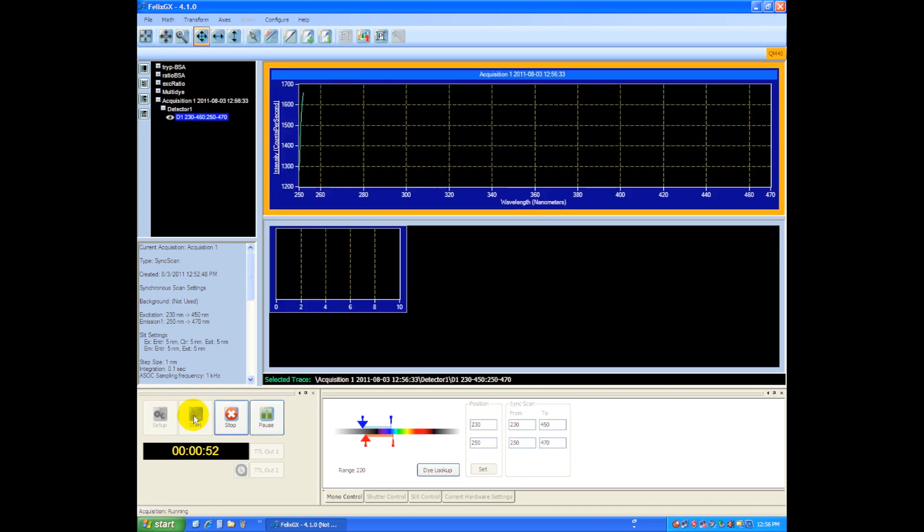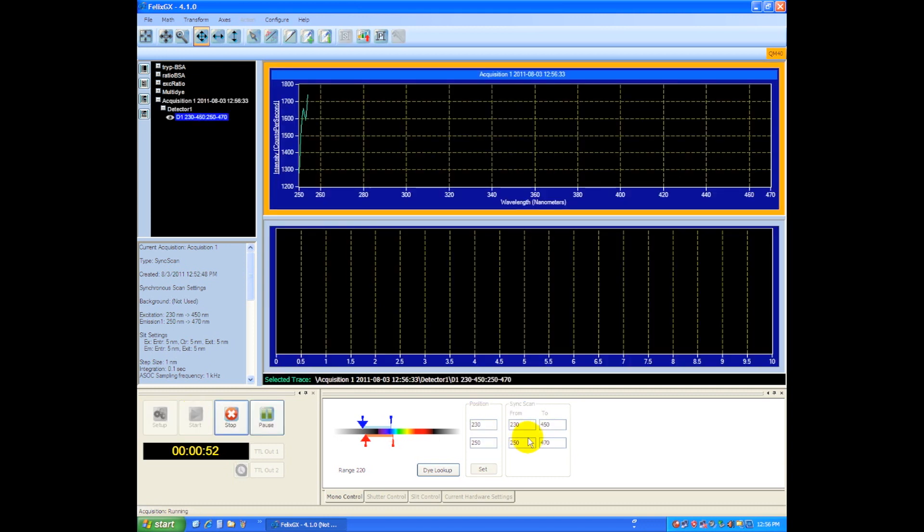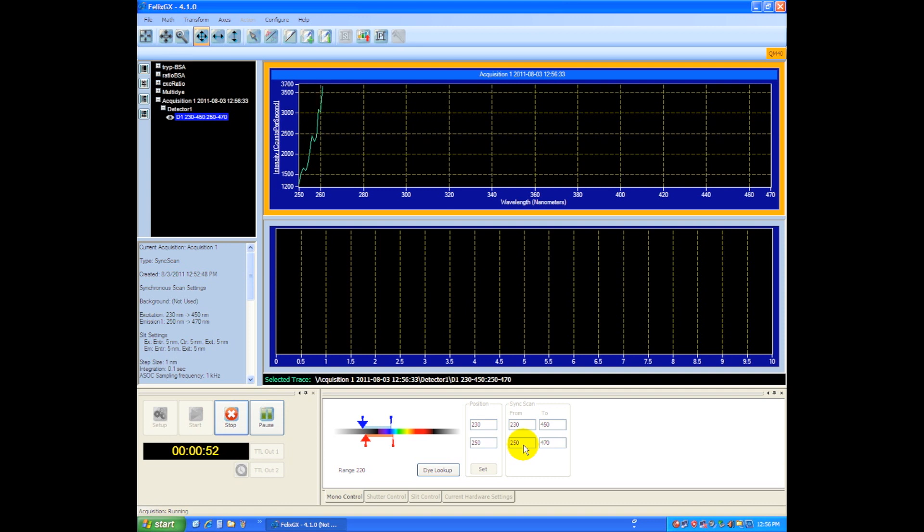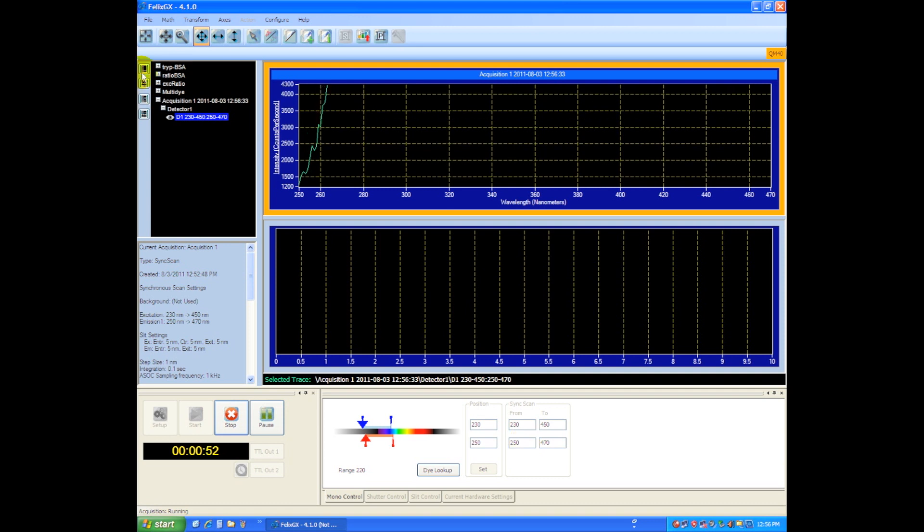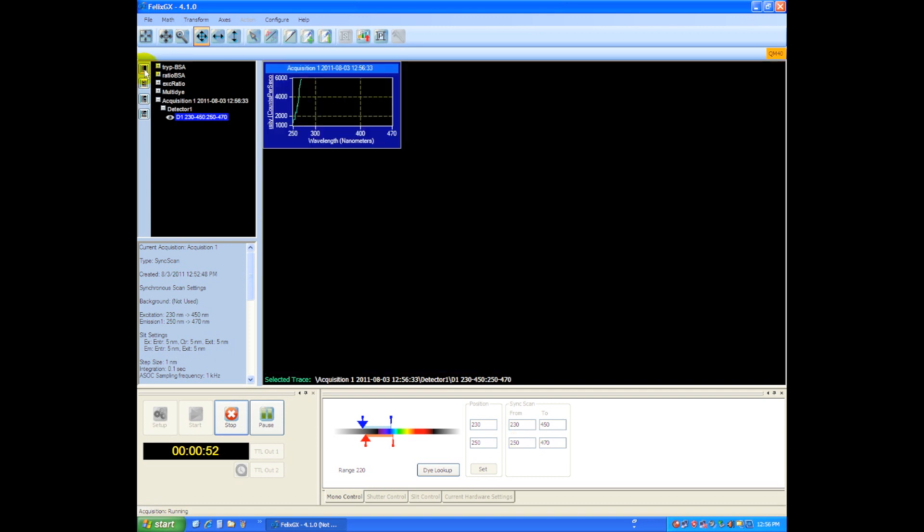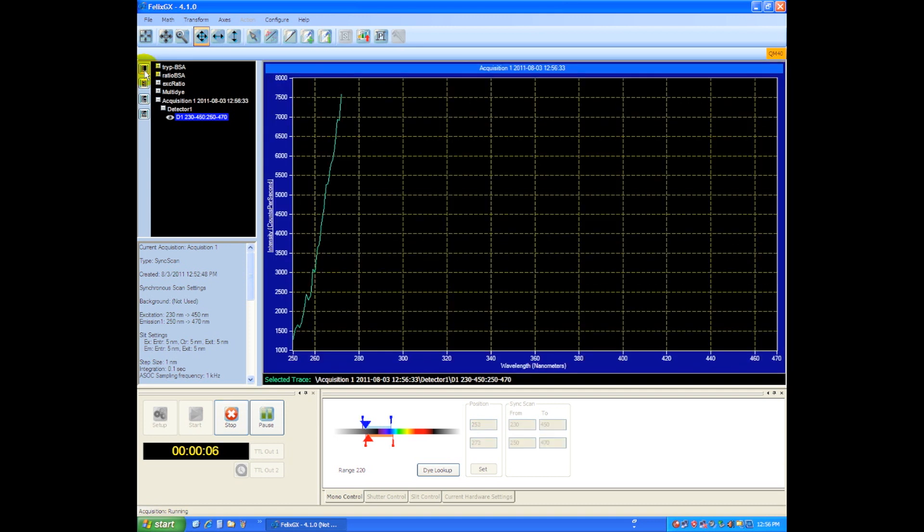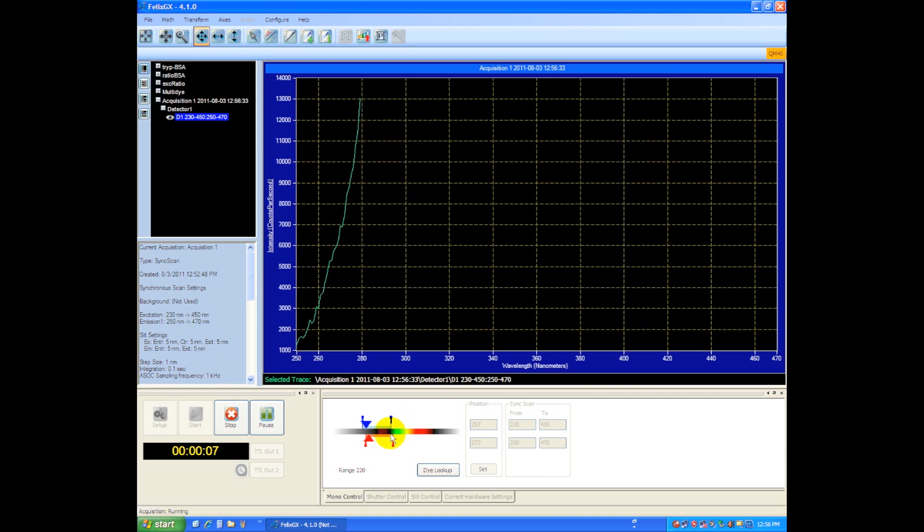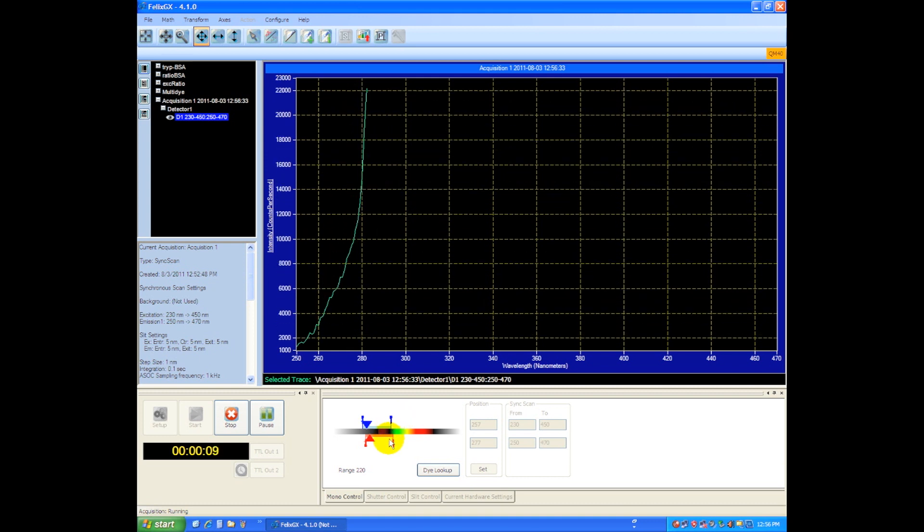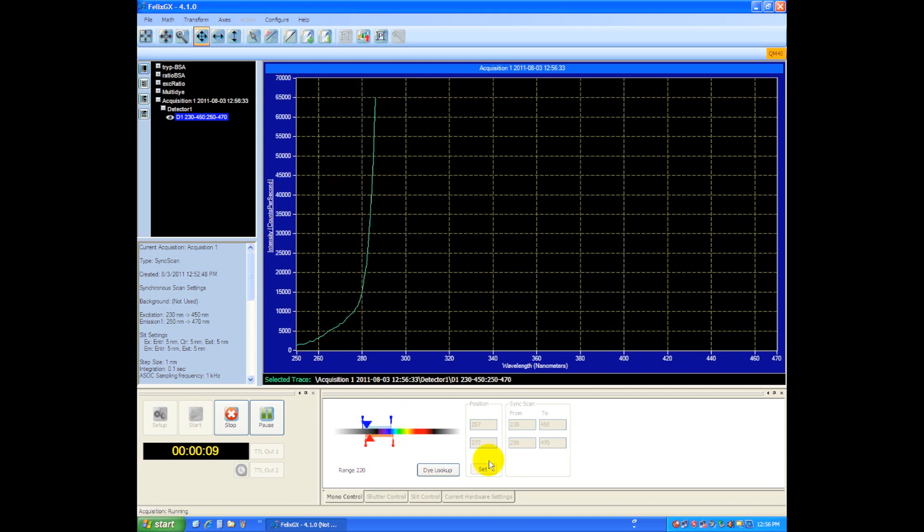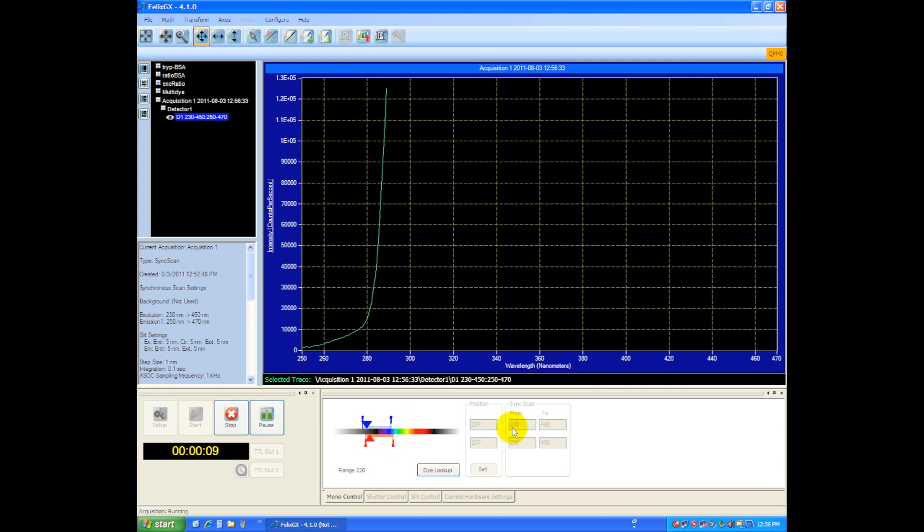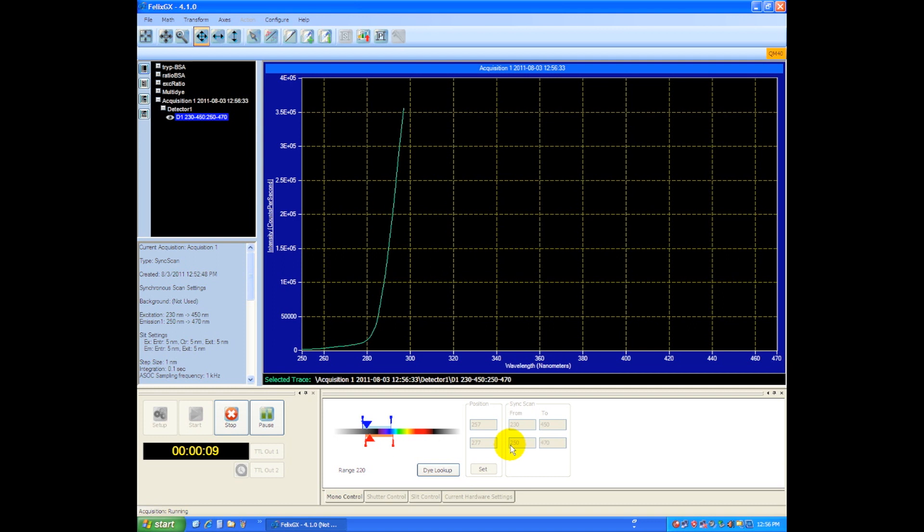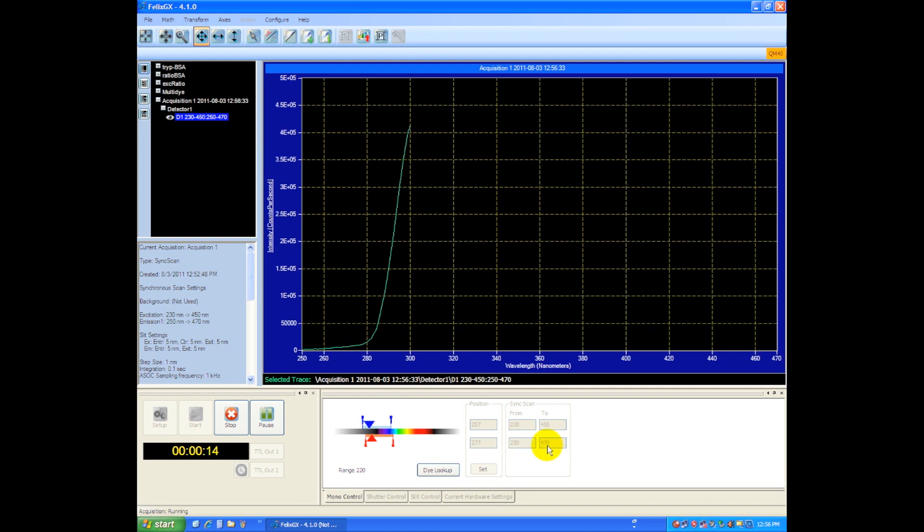Okay, you can see here the monochromator's positions. Let's go with our single window and the monochromator's range is scanning right now from 230 to 450 and from 250 to 470.